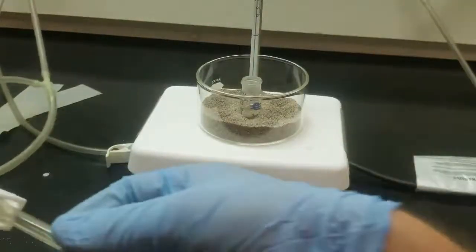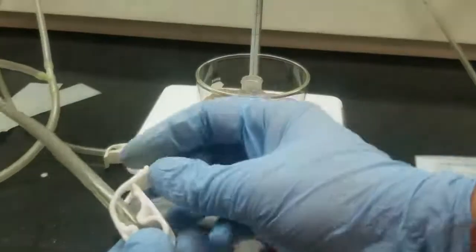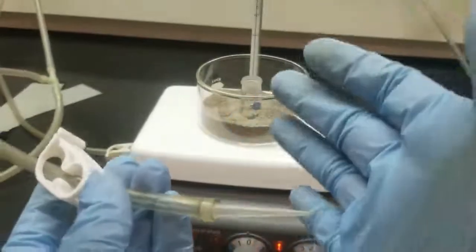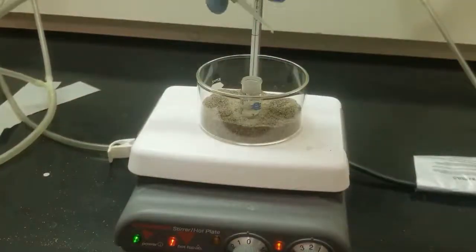And then these little rubber tubing hoses with a pipette on the end are connected to the nitrogen gas. You can see that it's clamped shut, so we can just pull this up here and that'll open it, and then you can feel a gentle stream of nitrogen gas pouring through here. And so you just want to go ahead and try to get this stream over the liquid.